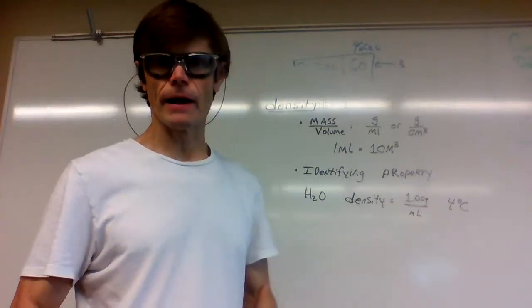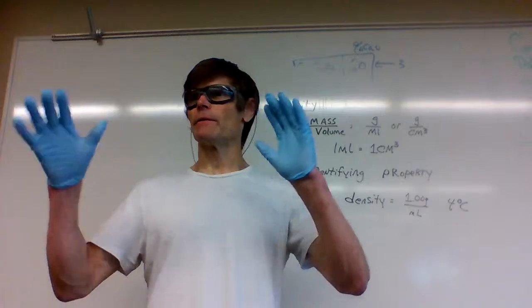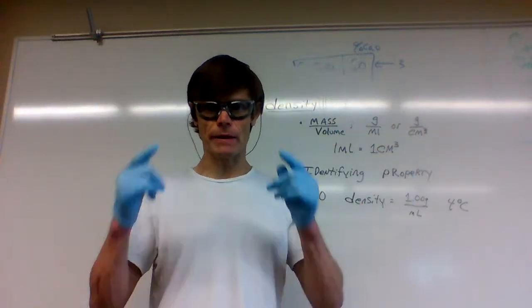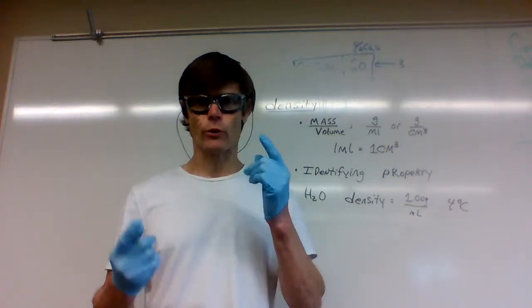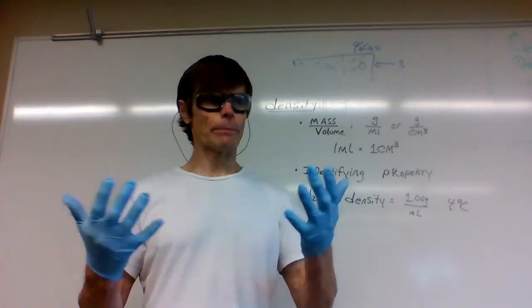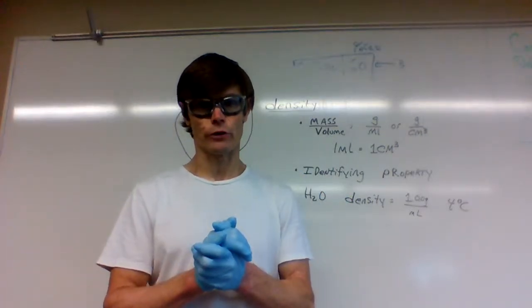Hey everybody, I'm in the lab today, so I got gloves on. My voice is probably echoing from the lab that I'm in. And I got goggles on because when we work in the laboratory, we always need to wear goggles, that's for sure. And when you get back to school in the real world, probably gonna wear gloves for a while too.